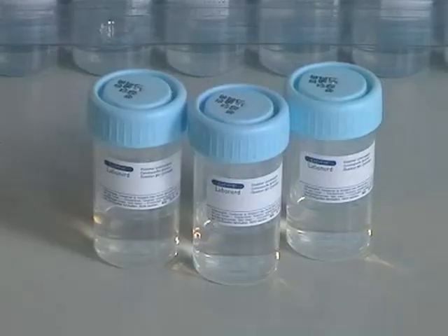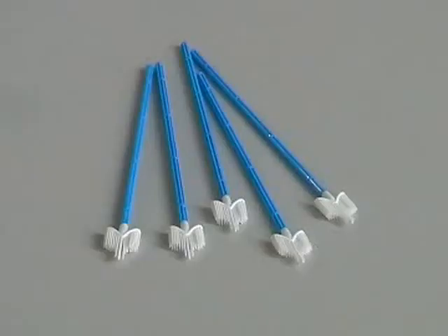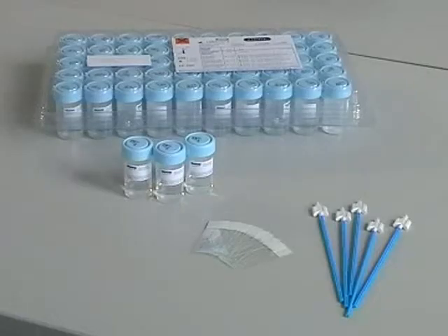Turbitec has low consumable cost. The kit includes a pre-filled vial, a coated slide, and a cervical sampler brush. Our pack guarantees you safe and secure transportation.